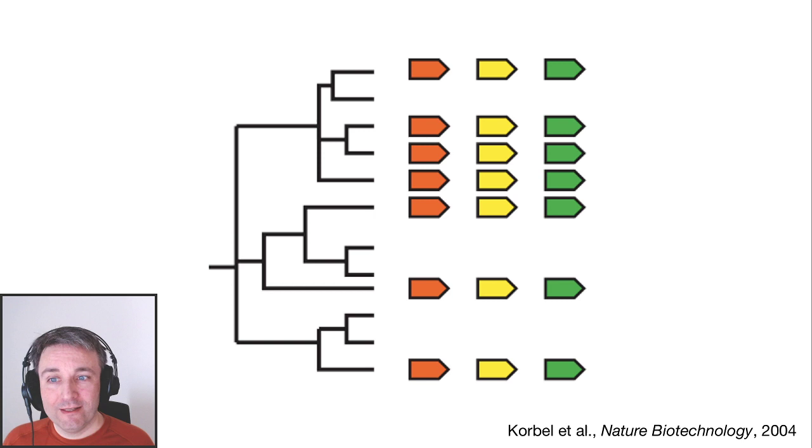It's not like one of these cases where, say, gamma proteobacteria have these genes and nobody else. You have close neighbors where one species has it, another doesn't. In another part of the tree, one has it, its neighbor doesn't. And to explain that kind of pattern, you need a lot of joint gain and loss events of these genes, which of course is exceptionally unlikely to happen by random chance. So what you do is that you say, well, since it's unlikely to happen by random chance, it presumably didn't happen by random chance. It happened for a reason. And the reason is that these genes are somehow involved in carrying out a common function. If you have all of these genes, you're able to do that function, whatever it is. If you were to lose one of these genes, you're no longer able to carry out that function, at which point you have no evolutionary pressure to retain the other genes, and you're therefore likely to just lose them pretty quickly.